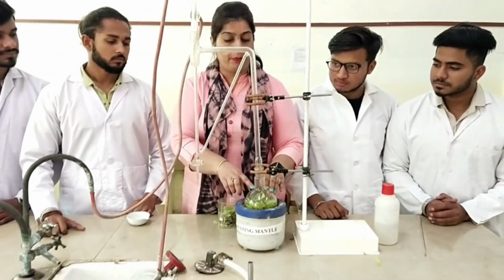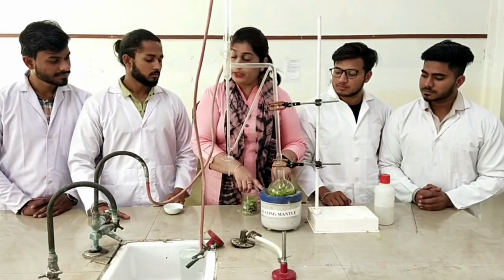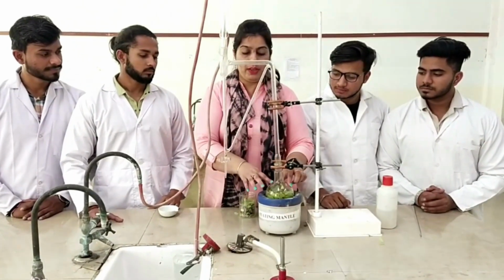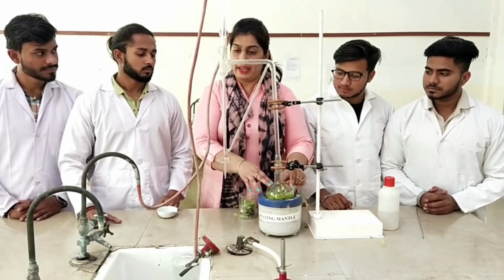Dear students, you have to remember this: the temperature maintained should be 40 to 50 degrees Celsius, because if you increase the temperature, the volatile oil content will be decomposed.